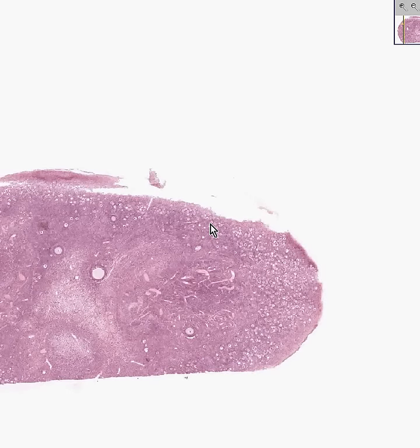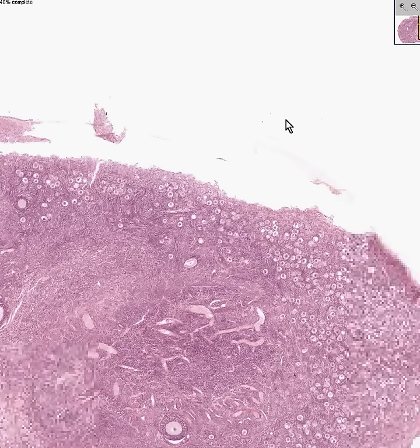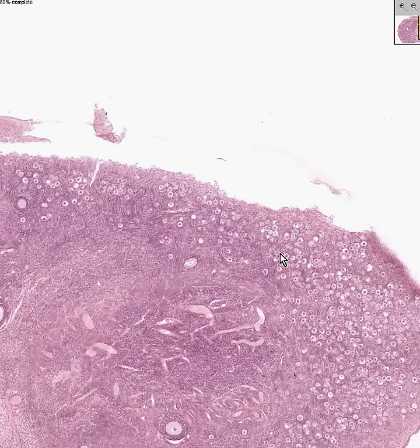A good place to start in describing the histologic features of the female genital tract would be an ovary. This is a human ovary — specifically an infant ovary, because it contains many features you would not find in an adult ovary.